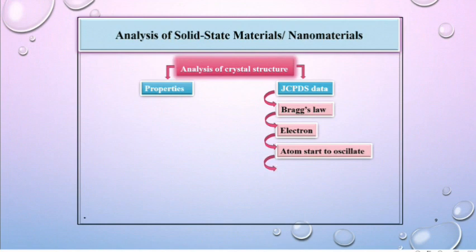However, when the atoms in a crystal are arranged in a regular pattern and in a few directions, there will be constructive interference, the waves will be in phase and there will be a well-defined X-ray beam leaving the sample in various directions. Hence, a diffracted beam may be described as a beam composed of a large number of scattered rays mutually reinforcing one another. The orientation and interplanar spacing of parallel planes inside the crystal are defined by three integers, that is h, k and l, which are called Miller indices.